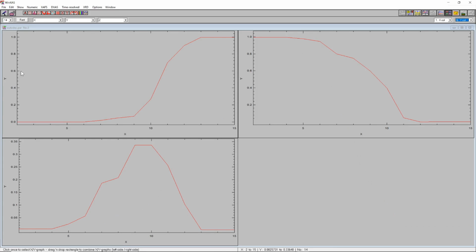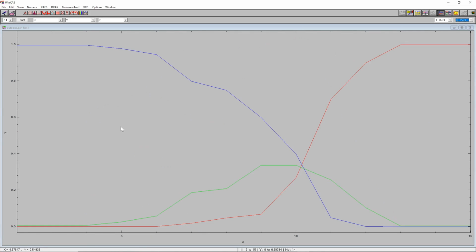And now we can just combine those, and we get the evolution of the phase composition during this reduction of vanadium pentoxide to the V2O3. And the formation of a VO2 intermediate phase here during this reduction. So this is of course very similar to what you already saw from the calculated concentration in the factor analysis dialog box, because as I said, this is constructed data.